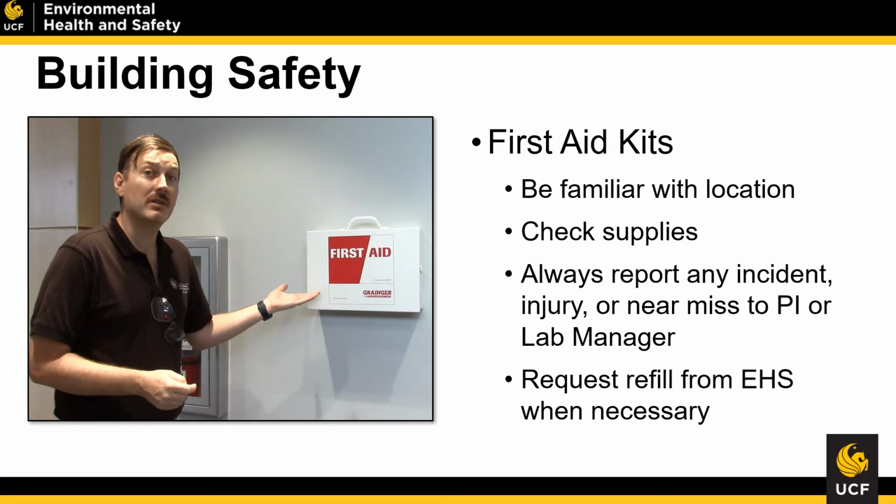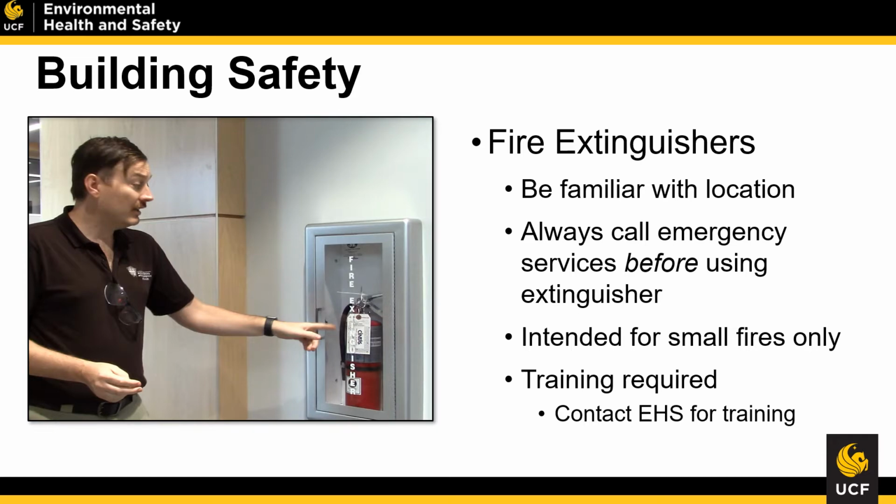Also, please note if you're using first aid equipment, that means you've probably had a laboratory incident or accident. Feel free to use it, but also make sure that your primary investigator or your PI is informed that you have used the first aid equipment. Let's talk about fire extinguishers.